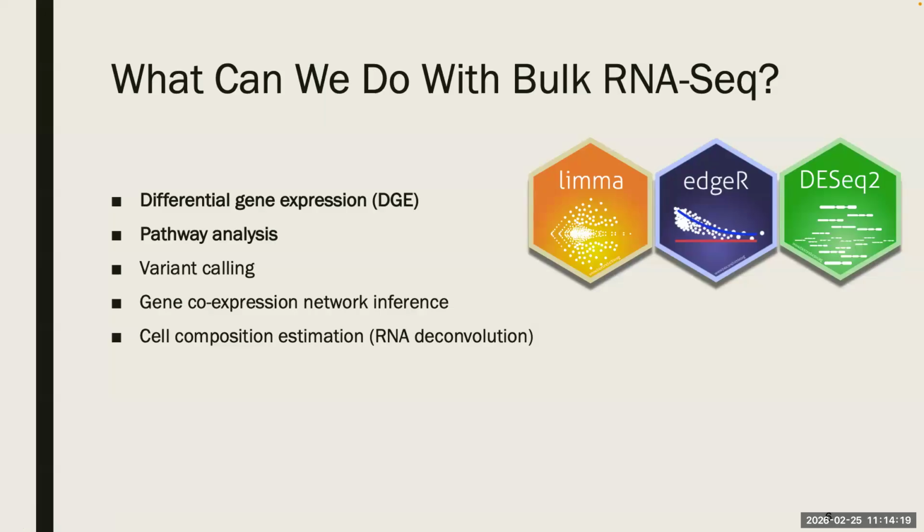Pathway analysis is a downstream application for differential gene expression. It identifies biological processes that are represented by these upregulated or downregulated genes, providing system-level insight beyond individual gene changes. And we will be going over these two applications in the R code.